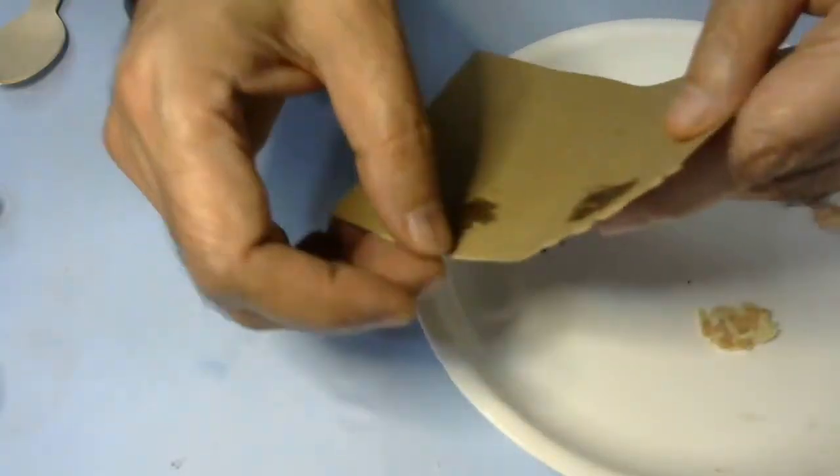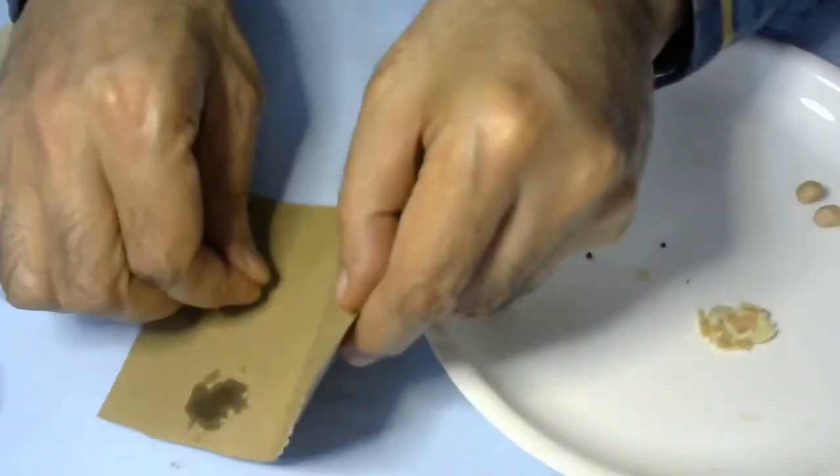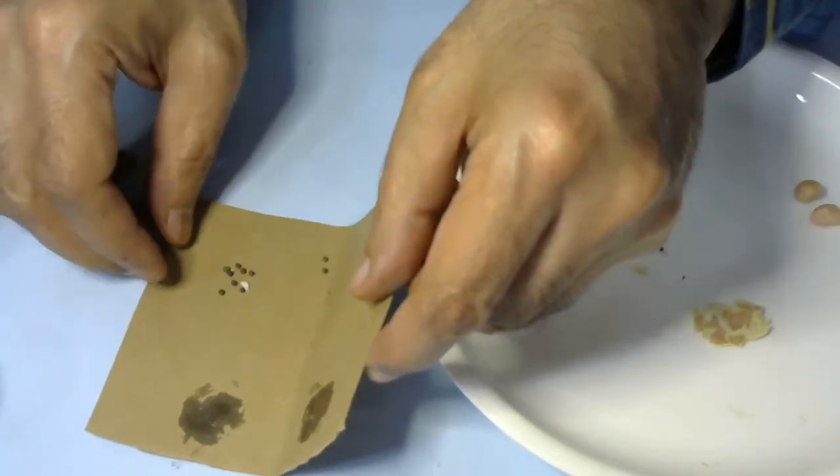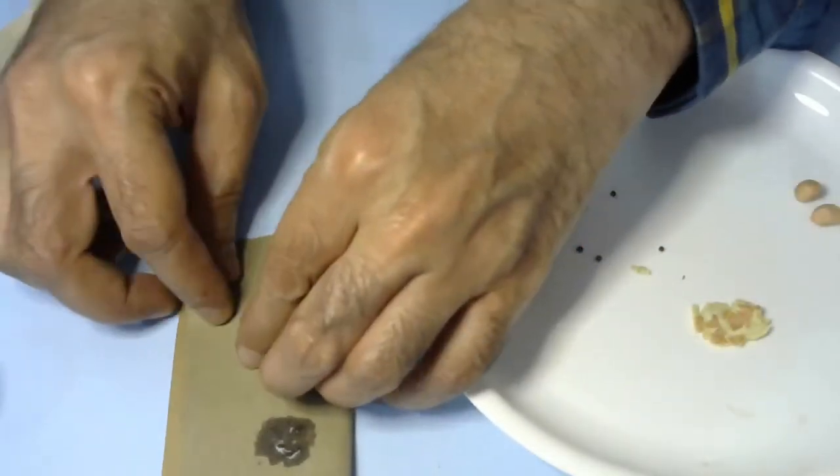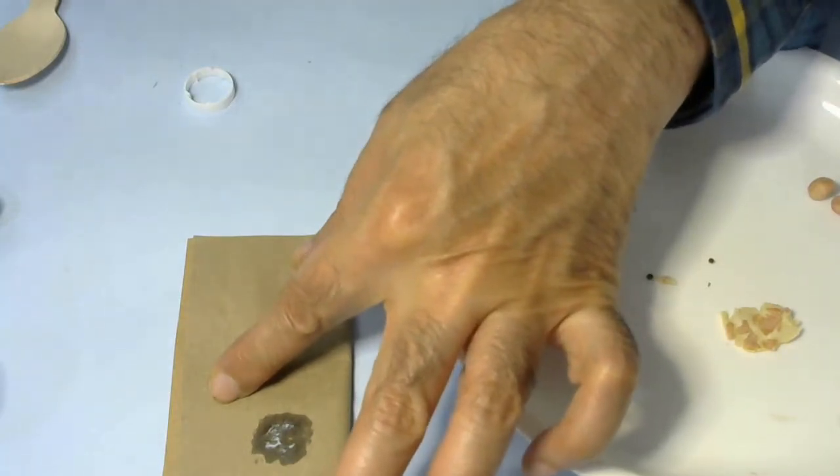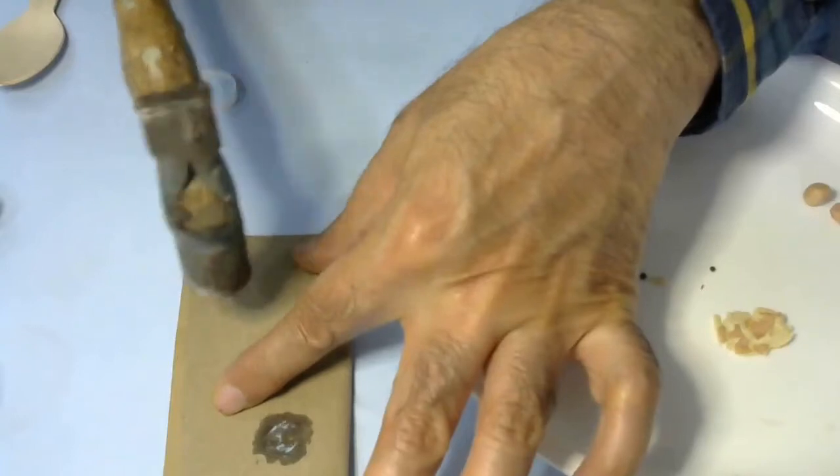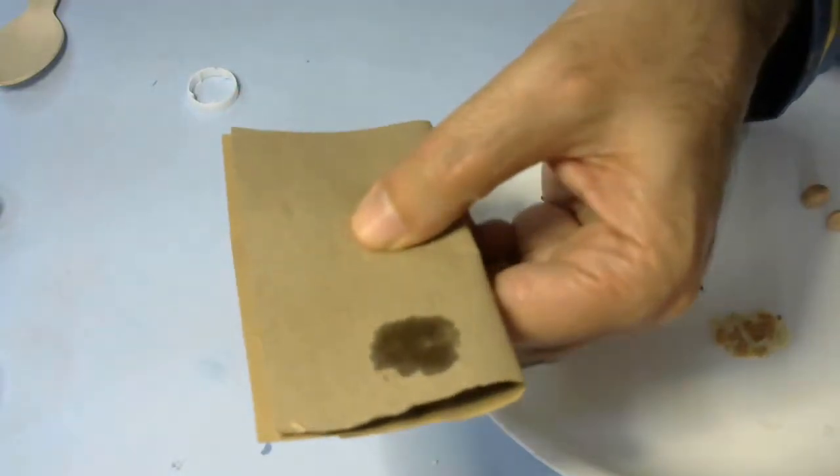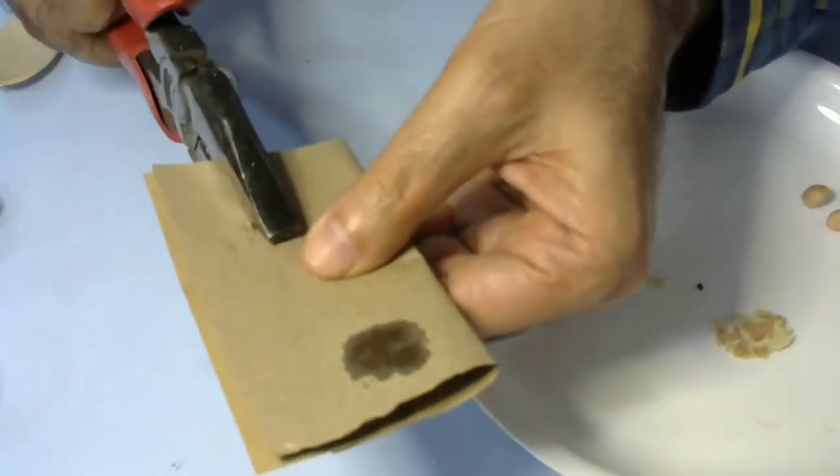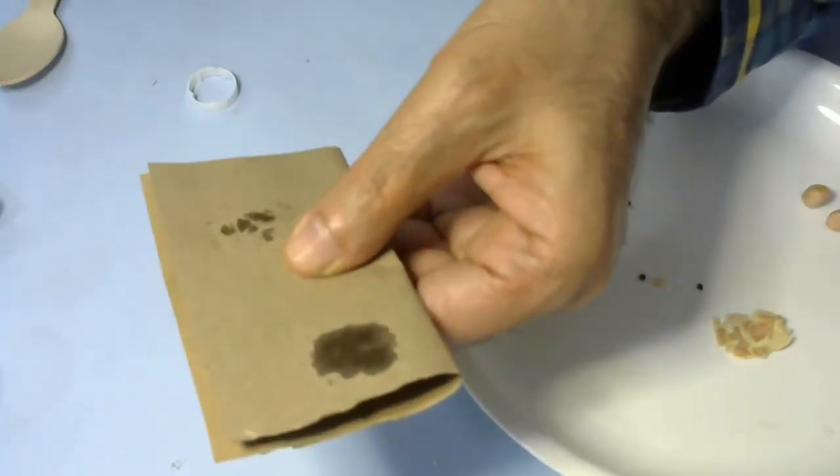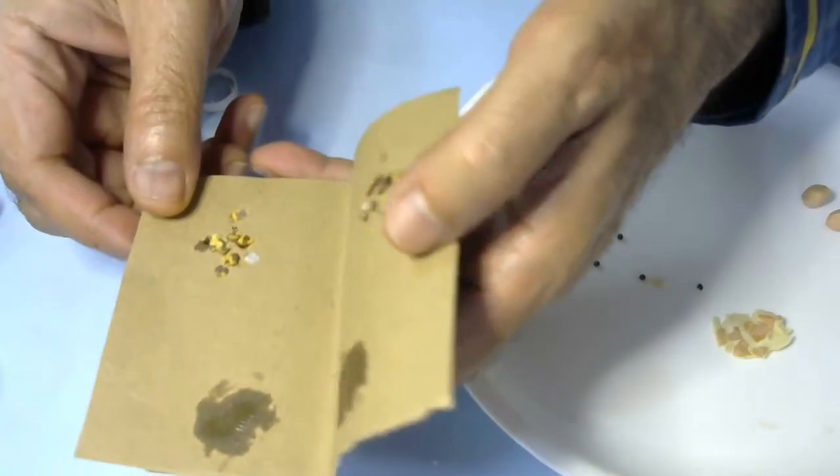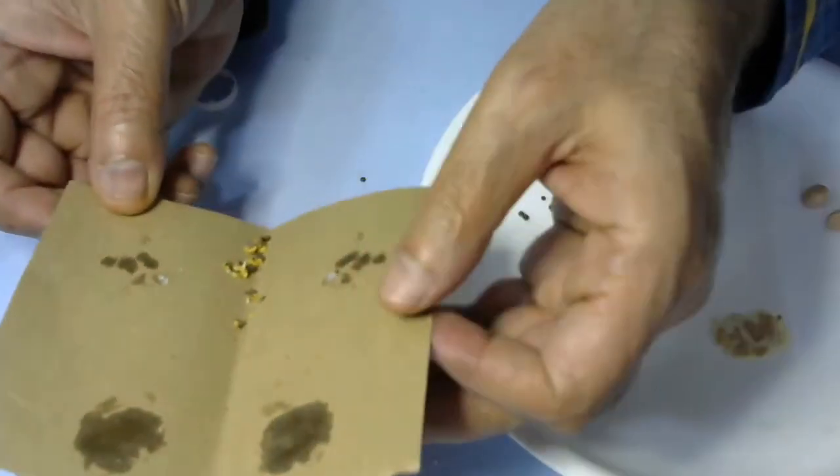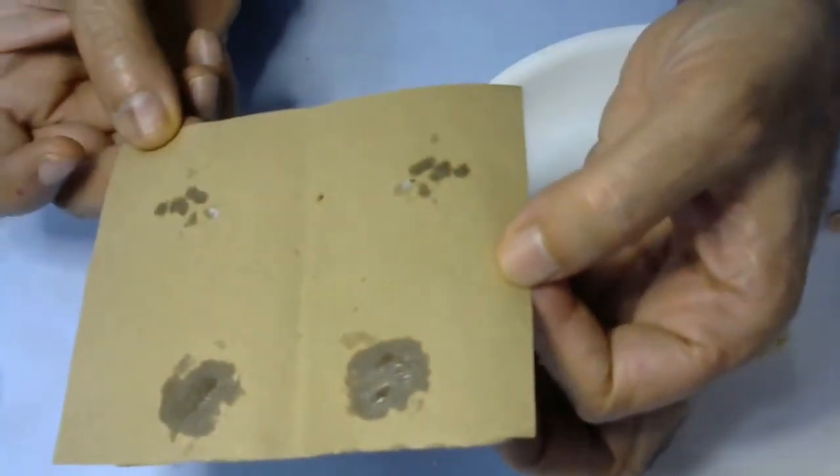We can do the similar test on mustard seeds. As you know, we extract mustard oil or sarson ka tel from these seeds. Again, I'll do the same experiment. Using a hammer, I'll crush them. To crush them even harder, I'll use pliers so I can apply harder force and crush them like this. Immediately, the oil or fat from mustard seeds comes out, which stains the paper and the paper becomes translucent. This is the simple test to see if food contains any fat.